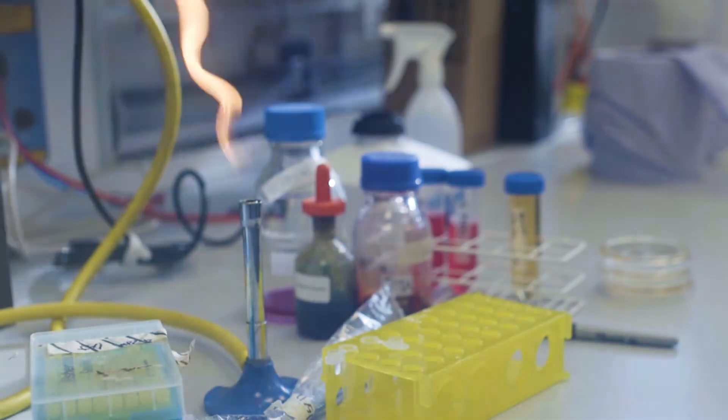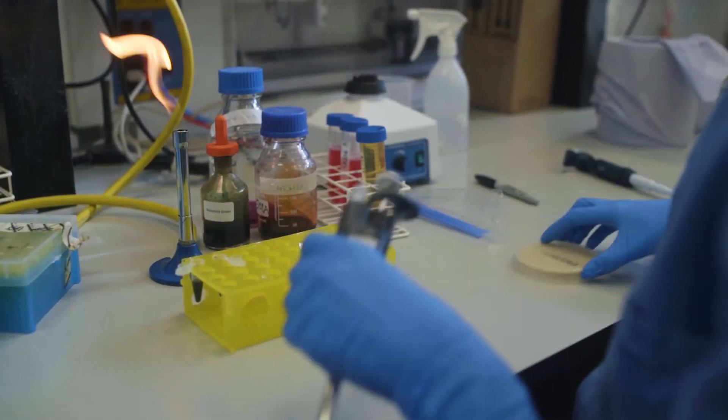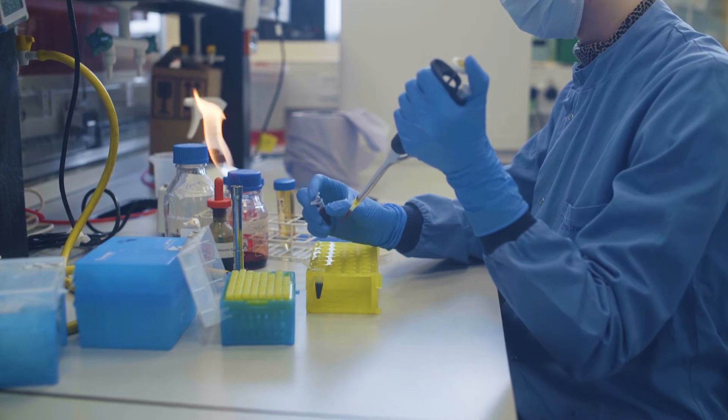My research group looks at infection control and diagnostics. A key element of the infection control project is evaluating samples of Clostridioides difficile from the environment.